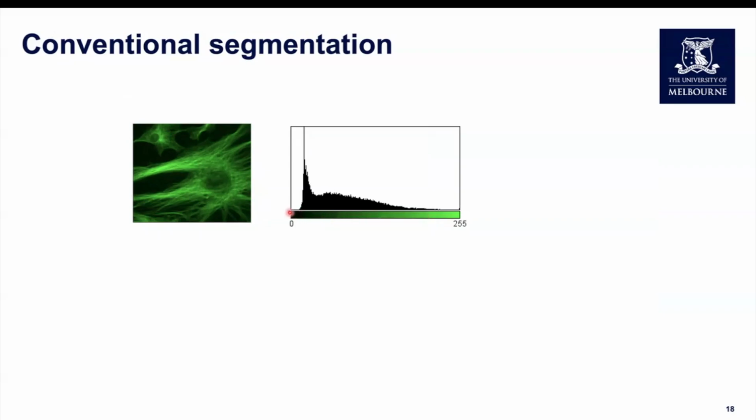So again, this is our intensity histogram. So we've got low intensities down here. So at the 0 range, they come up black in the image, and high intensities are in the bright green up here to 255 grayscale values. Again, the important thing is you don't saturate, so you're not hitting this maximum value. That allows you to really work well within your image data.